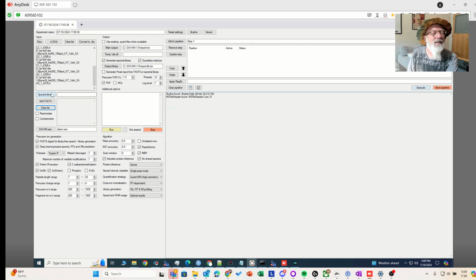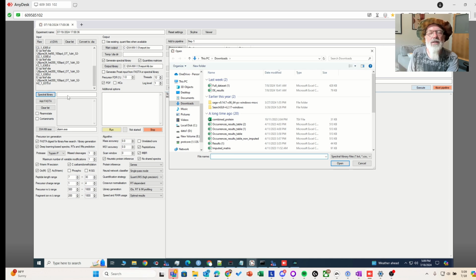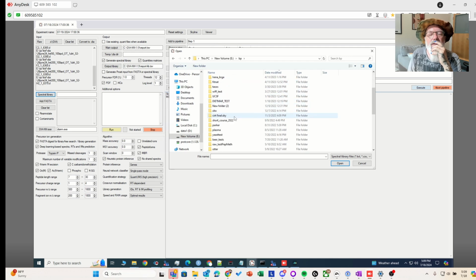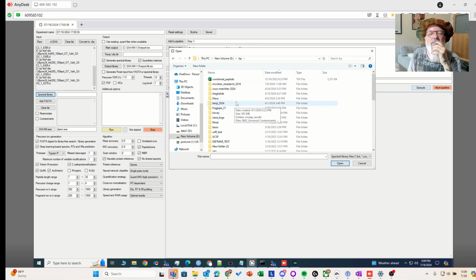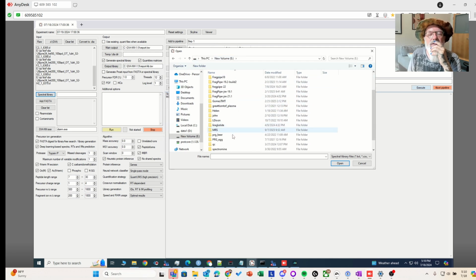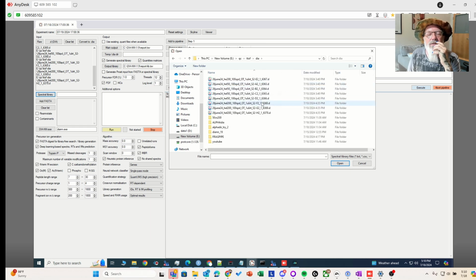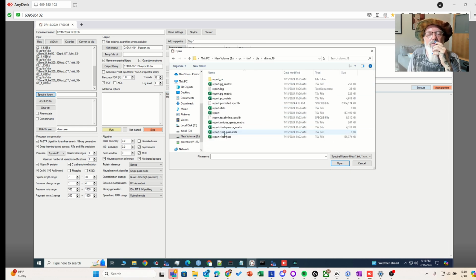Okay, after all day or all night, it will generate a library. So you come back the next day, you hit library, and let's see where I put it. Under QC, timsTOF, DIA-NN 1.9, and you'll see a stupidly named spectral library because I just named it something stupid.